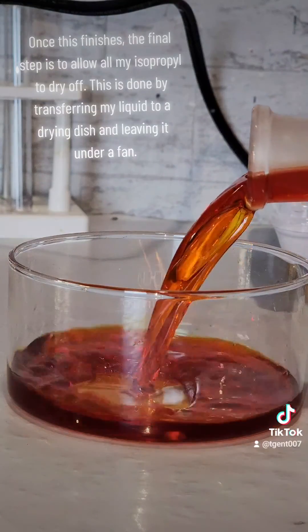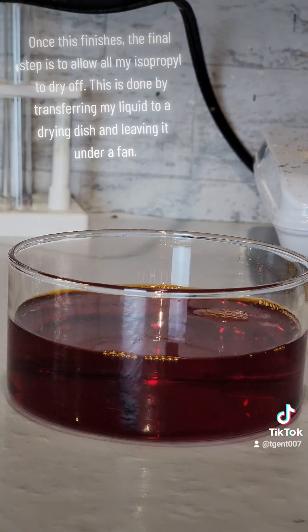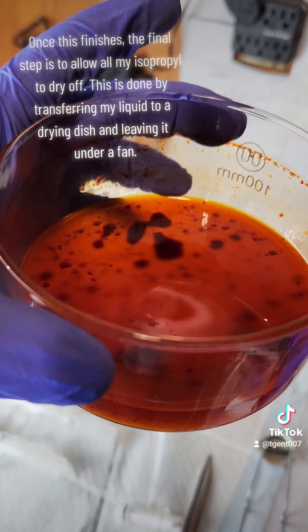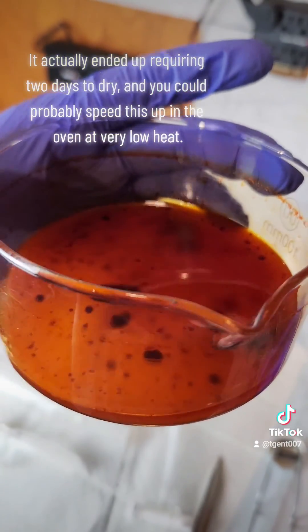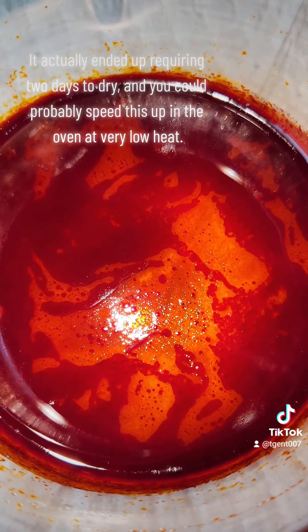Once this finishes, the final step is to allow all my isopropyl to dry off. This is done by transferring my liquid to a drying dish and leaving it under a fan. It actually ended up requiring 2 days to dry, and you could probably speed this up in the oven at very low heat.